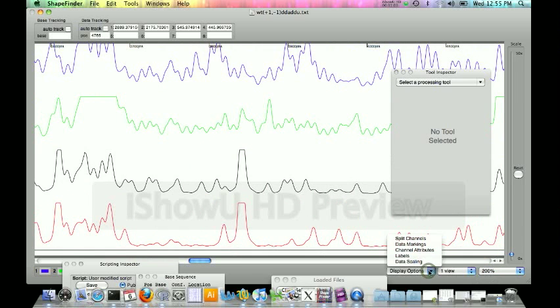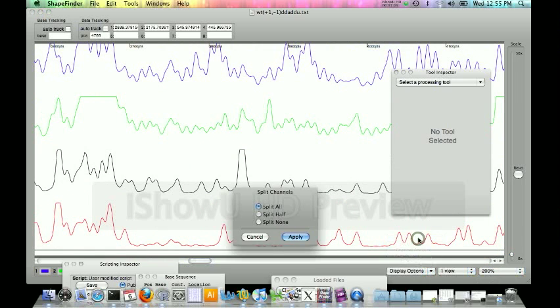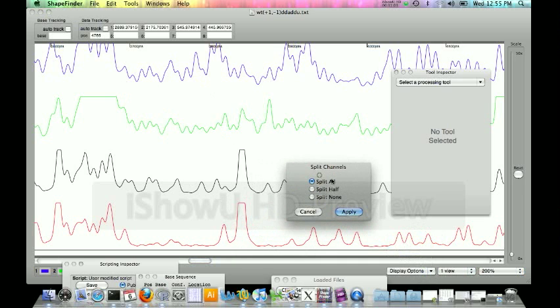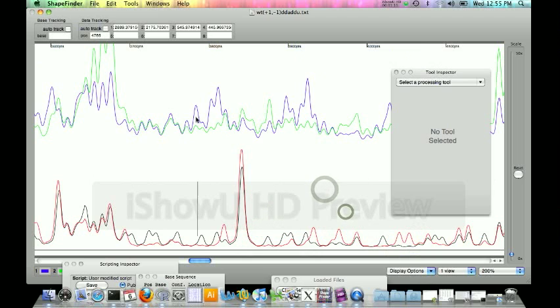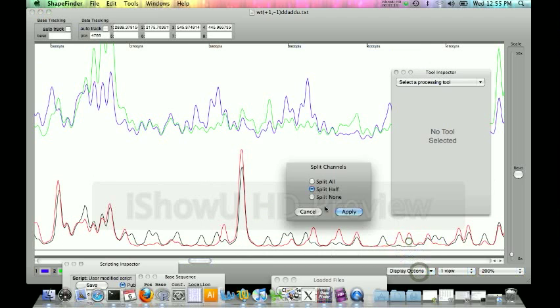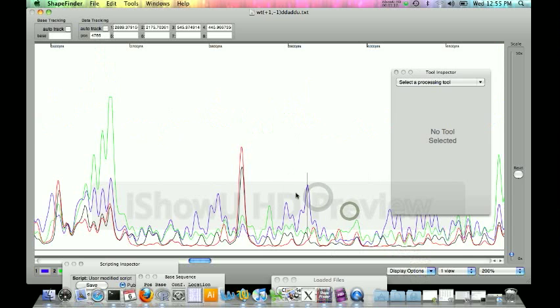Other things you can do with the display options, you can split the channels. You can keep them split all, which is the way it's set right now, all four channels are split. Or you can split it half, where the first two filters are overlaid and the second two filters are overlaid. Or you can overlay them all on top of each other, all four.